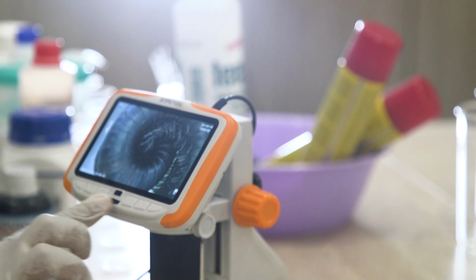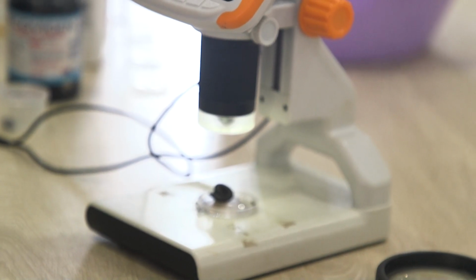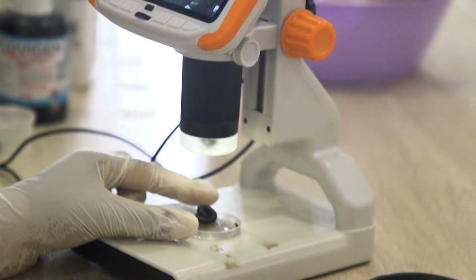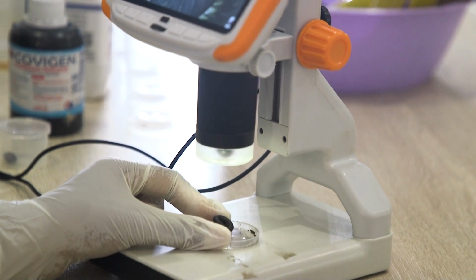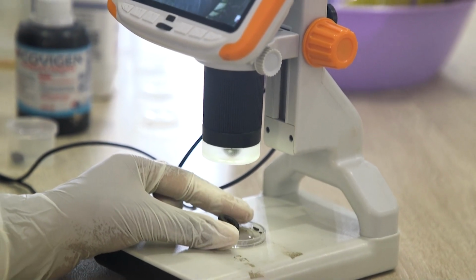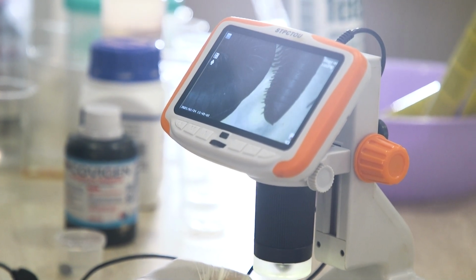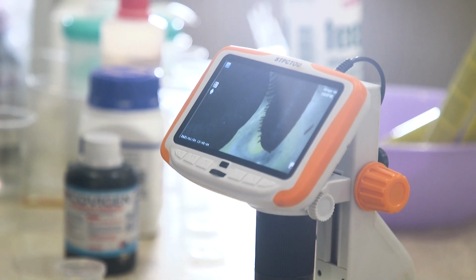Oh my god, they are medium. Their legs look like hands. If it's moving, I'm gonna kill it. So far this one is immobilized, so it can't move, but you can visualize its legs, its body. You can see its legs are segmented. This is the anal part.